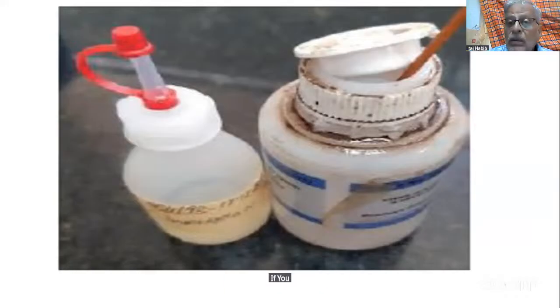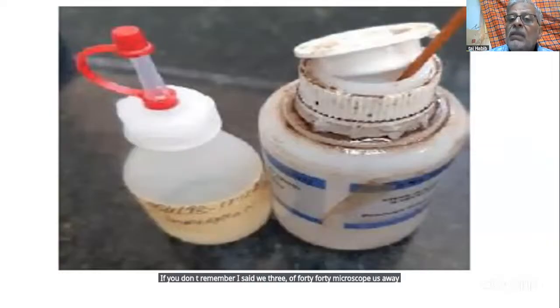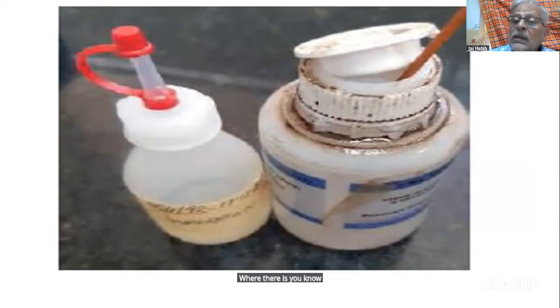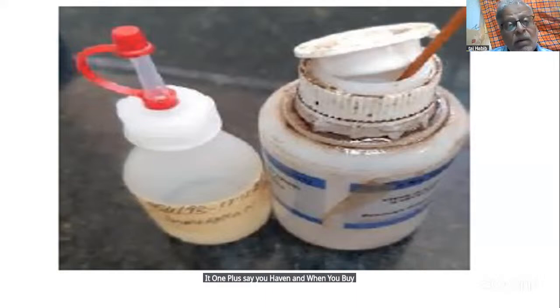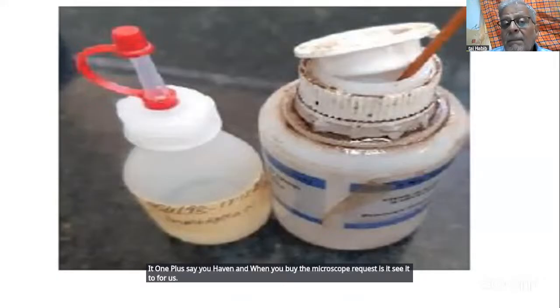If you don't, remember I said we threw 40 microscopes away because nobody was covering them. Microscopes are very sensitive in areas where there is high humidity, especially if it is salty humidity. It won't last even a year. And when you buy the microscope, request, is it sealed for fungus? They charge you extra.